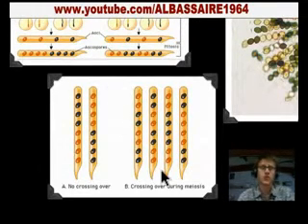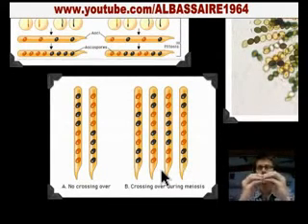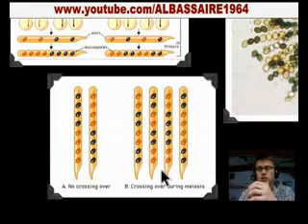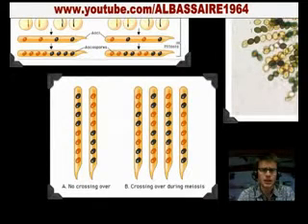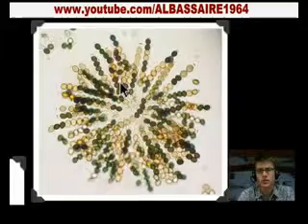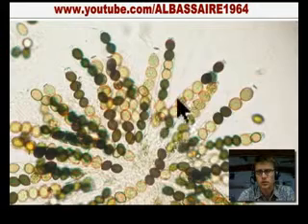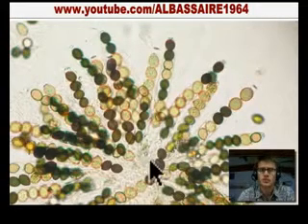That means that when these two fungi, and I should have said that a second ago, you have a tan fungus and a dark brown fungus, and as they grow next to each other, they produce these spores, which are a hybrid of the two. You then squash them out, and you can see these different spores. But in those creation of spores, or in meiosis, if you get a 4 to 4, that means that no crossing over occurred. And so we can look at this and we can do some stats on it. In other words, this is a 4 to 4, and so this one, there's no crossing over. Or in this one, it's a 4 to 4, so there's no crossing over there. But on this one, you can see it's clearly a 2 to 2 to 2 to 2, or this one's a 2 to 4 to 2. And so we could say that those two actually show crossover.